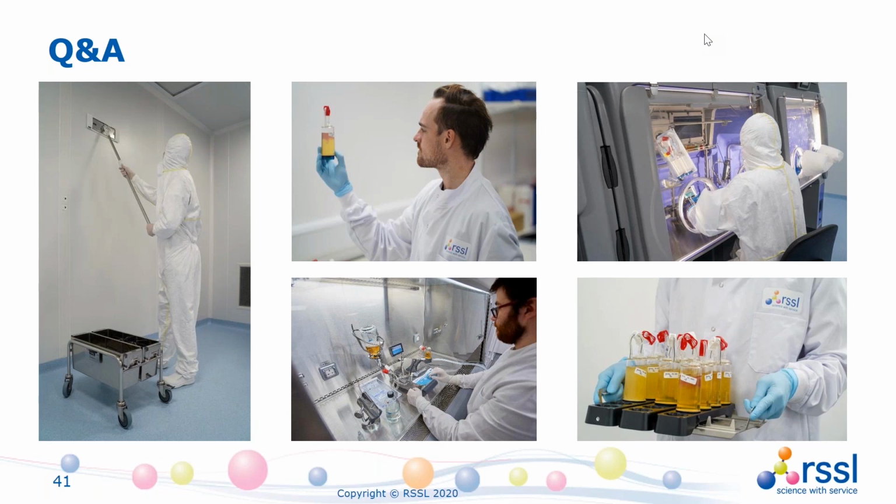And just one more question from Chris, and that is, how important is profiling microorganisms in relation to cleaning and disinfecting? I think it's really important, and it's one of the things when I talk about environmental monitoring, in that it's not just about the numbers, it's about the types of microorganisms, and then knowing how effective your disinfectant is theoretically and then through efficacy studies against those microorganisms. Because if you do start particularly seeing bacterial and fungal spores, then that will trigger calls for concern. It may or may not be the disinfectant.